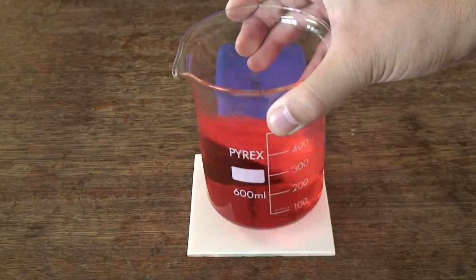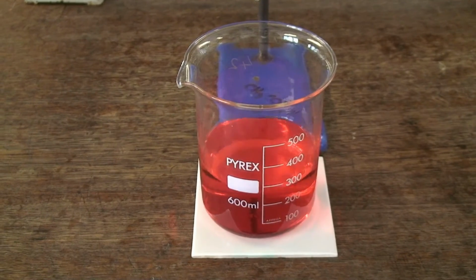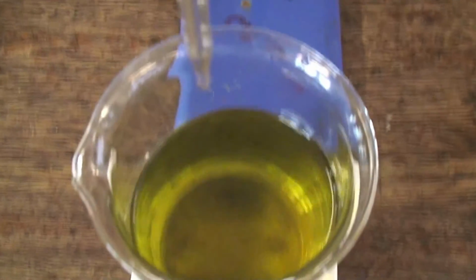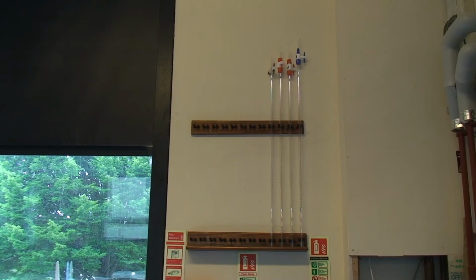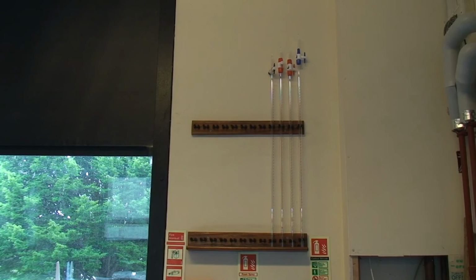An extra step is to add your universal indicator into the waste beaker, and after adding all your waste solutions, it should be neutral, which is green, meaning it is safe to dispose of. Then make sure to rinse the burette for the next person who wants to use it, and make sure to open the valve and put it upside down so that it drains properly.